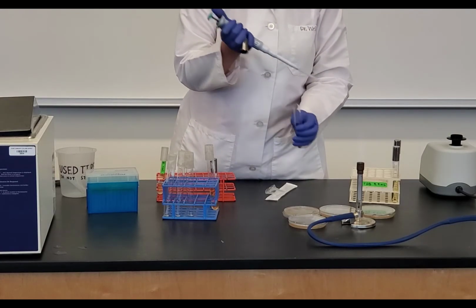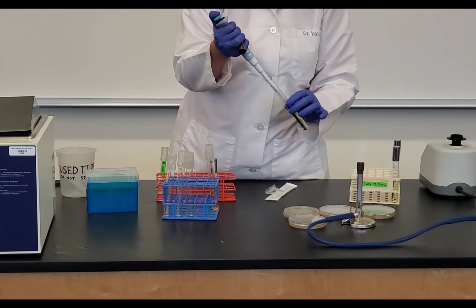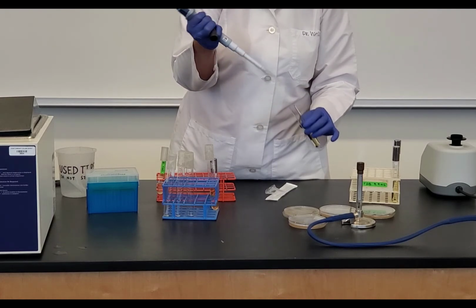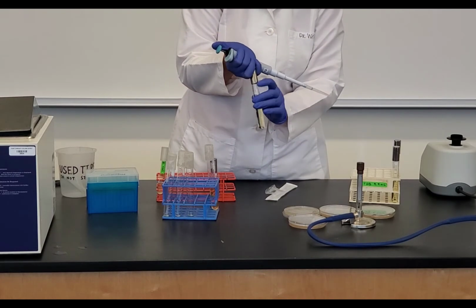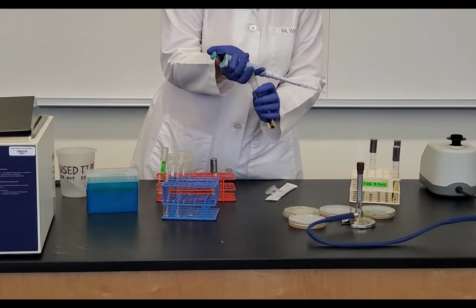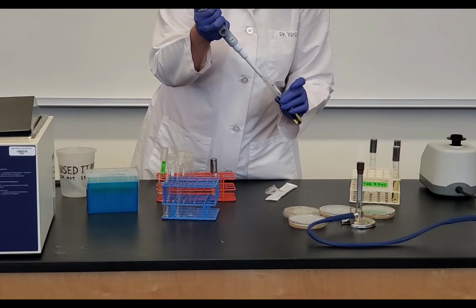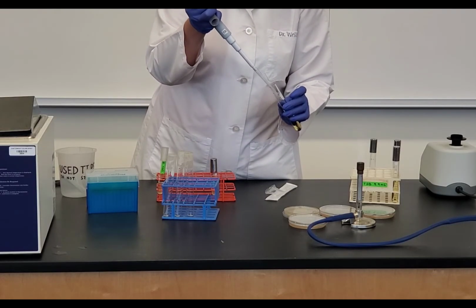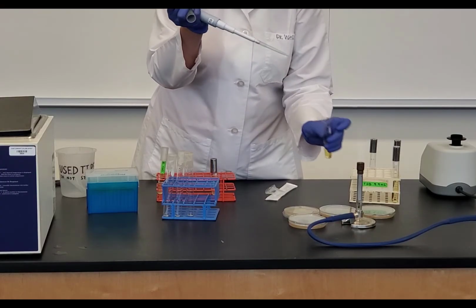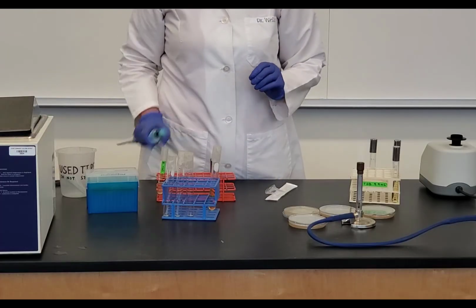Take the cap between my pinky and ring finger, flame the opening, put the tip in, slowly release my thumb, flame it, cap it, take my melted agar deep, flame the opening, add it to the agar. Okay, flame it, recap it, get rid of my tip.